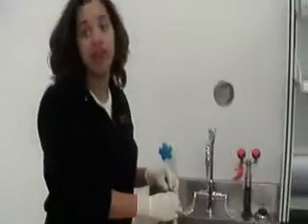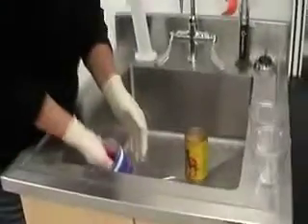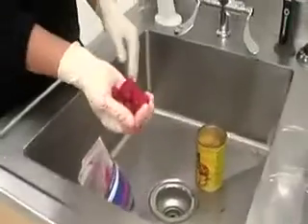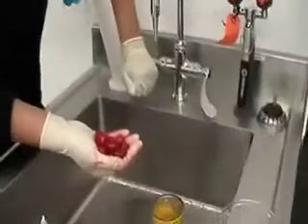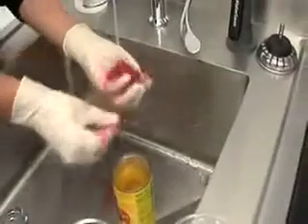Rinse the peaches and the strawberries. You can do this before the students arrive, especially if you have a lot of students. You might want to rinse the entire bag of strawberries at one time. But in this case, we're just going to show you a little demo, and I'm going to rinse exactly what we need for one experiment. So grab a small handful of strawberries, about like this, and go ahead and rinse all the sugar from the packaging off of the strawberries.